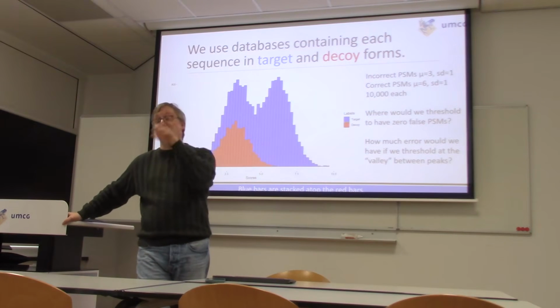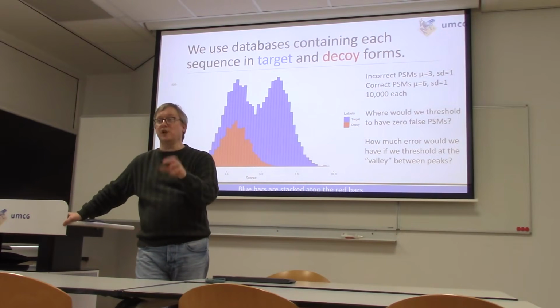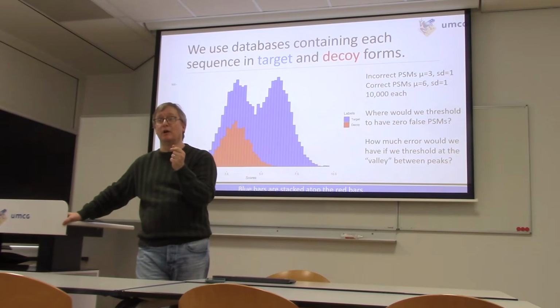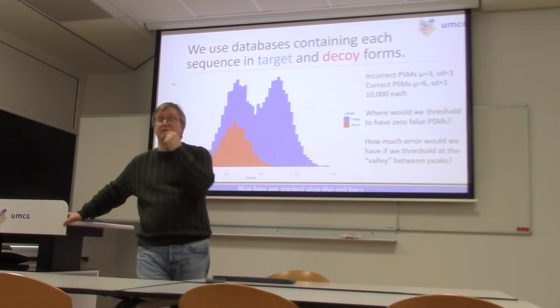So if I match an arbitrary sequence to it, there will be some amount of hit rate. And I'm going to compare tens of thousands of sequences to this spectrum. So the chance that an incorrect sequence will outcompete the correct sequence is real. That can happen. Or it can simply be that this spectrum doesn't have an explanation that's in the search space.